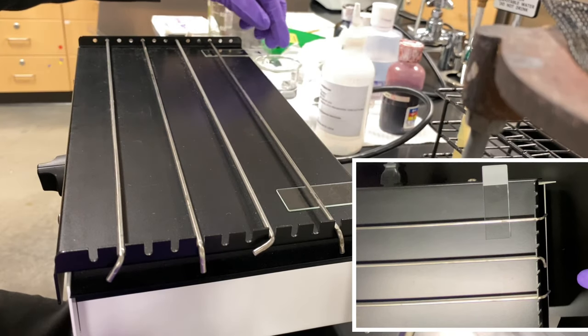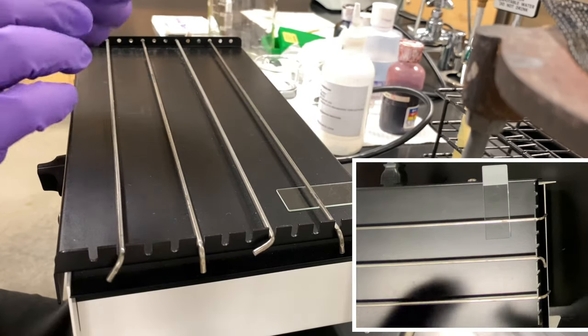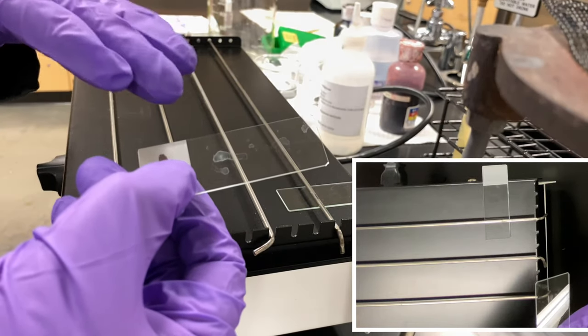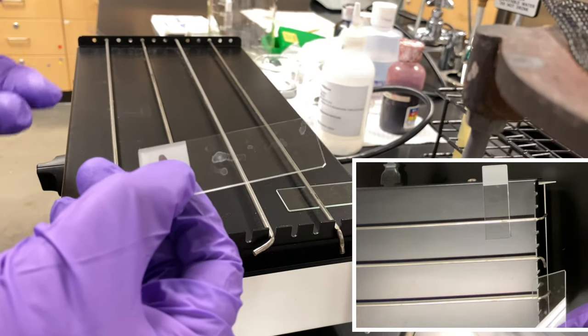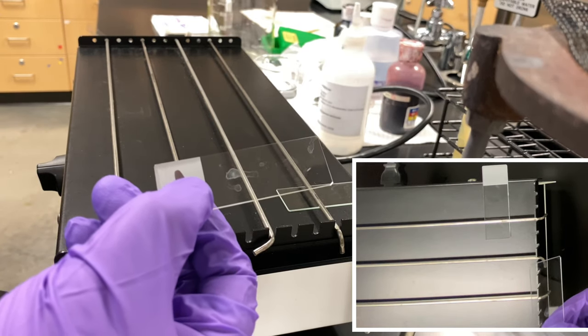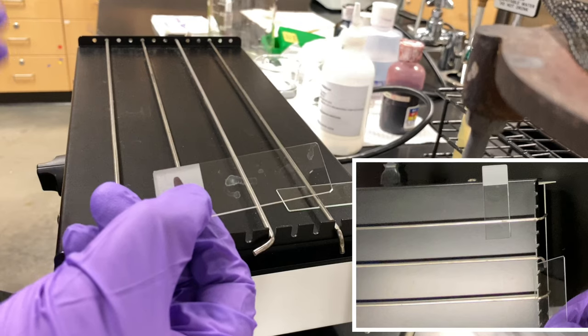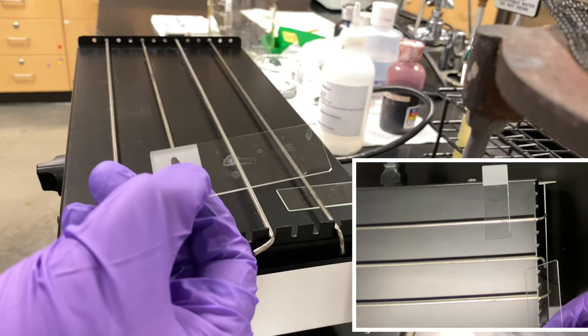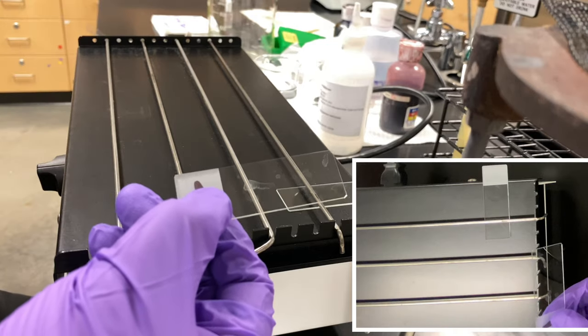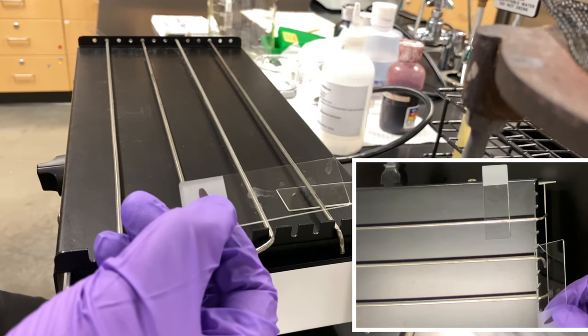What you'll start seeing is by the time it's done smearing and heat fixing, it'll create a very unique look to it, like some water dried out. In essence it did, but now it has an organism in there. What you have effectively done is allowed it to attach itself to the glass. Now we can proceed with the actual gram staining procedure or any other staining procedure.